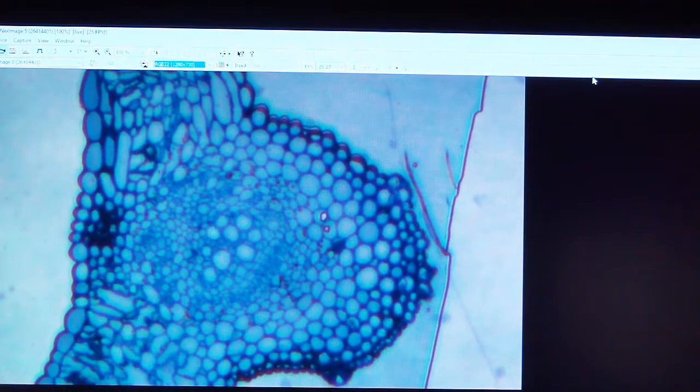Here's the block face after I've already thick sectioned it, and as we take a look at it, we can see it's a relatively large sample, and we'll measure that a little bit, but that the sample itself, I don't see any voids. As we look down it, there's no holes visible. Sometimes we can see that. And if I take my ruler and measure that, I can see it's 3.5 millimeters large. So when I said I was doing this as a negative control or to see what can really be done, that's a good example.